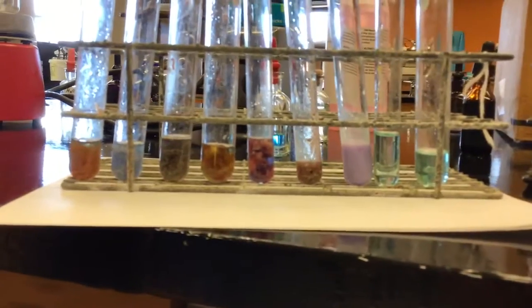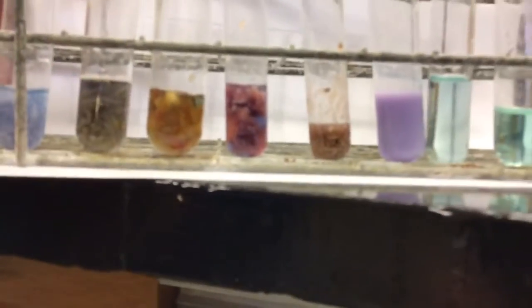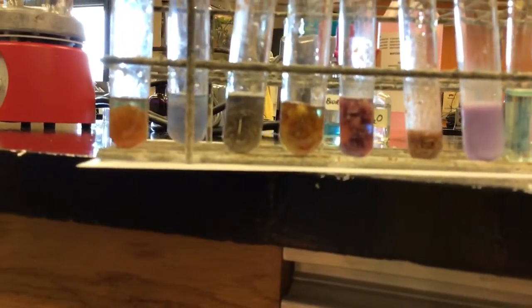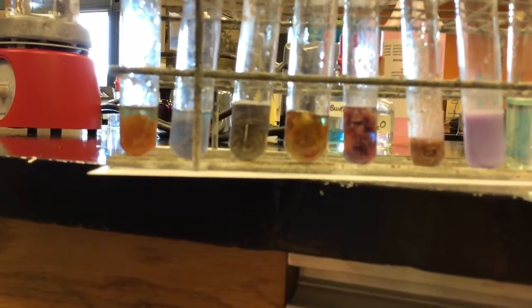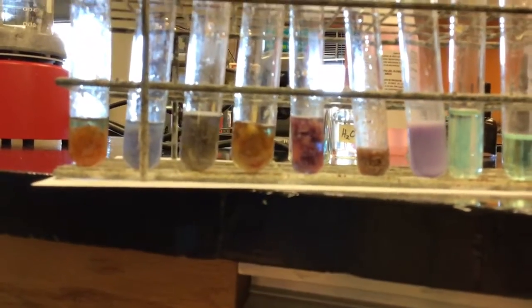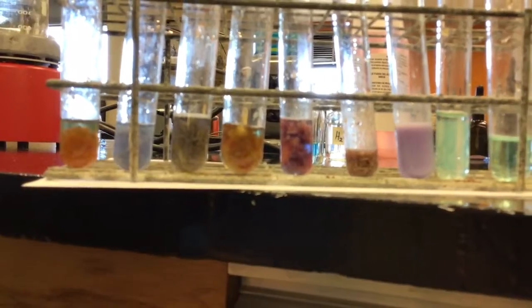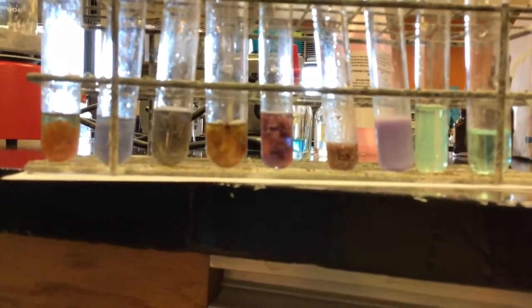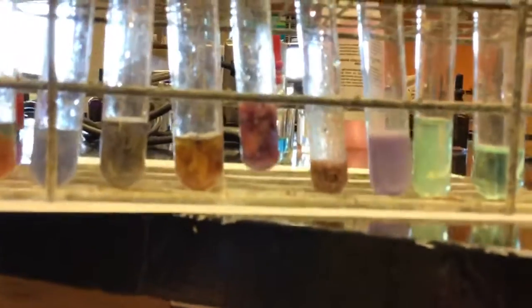Okay, we're coming around on 2 minutes. So the question now is, what colors do we have? This is the carrots. This is the bread. I would interpret that as a very slight purple. This is the potato, definitely changed, but again, the Biuret is a base, so it does have chemical reactions with some of the stuff. That's the apple. That is the meat.